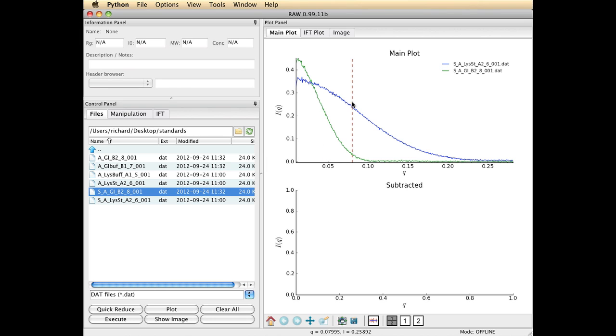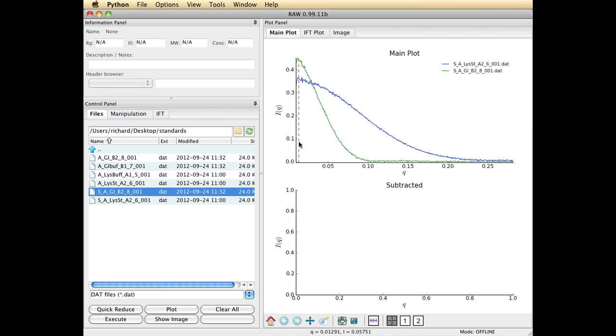You'll notice immediately over on the right hand side here, the images have appeared and we have a linear Q scale and the intensity scale.